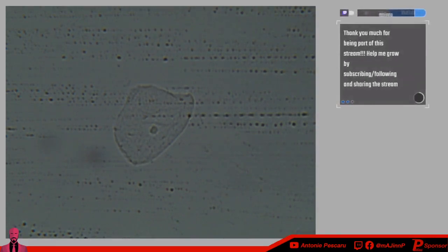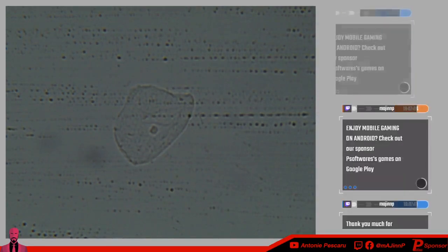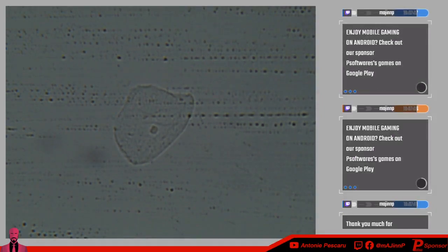So the big question is, why buccal cells? Well, they're the most basic thing that you could take a look at, a basic living organism. Of course, these are dead because they're not moving. But then again, cells take their time to move, maybe per hour.